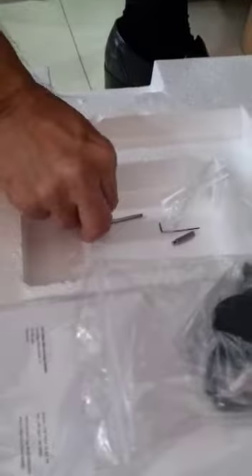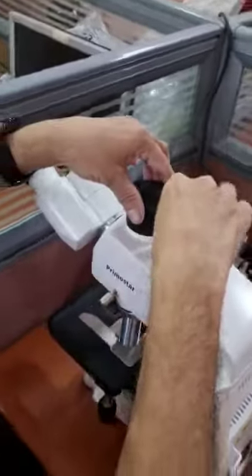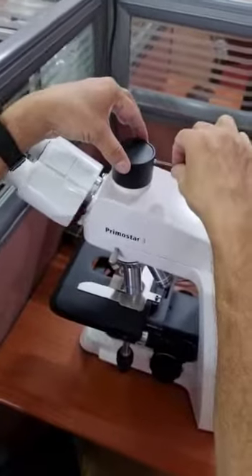In that pouch you can find two Allen keys. Take the bigger Allen key — this is a 2.5 mm Allen key. Take the Allen key, turn it anti-clockwise and remove the dust cap. Keep it aside.